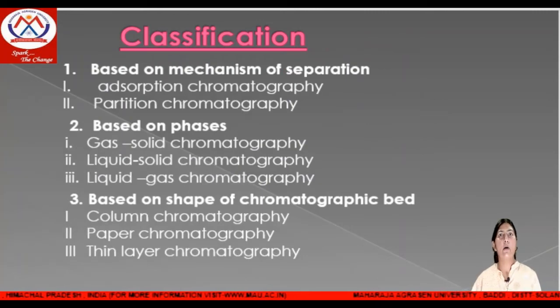Now we will talk about the classification of chromatography. Various techniques have been classified on the basis of their mechanism of separation, on the basis of phases, or on the basis of the shape of the chromatographic bed. First, on the basis of mechanism of separation, we classify chromatography as adsorption chromatography and partition chromatography.